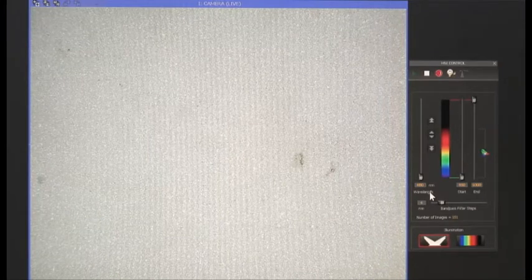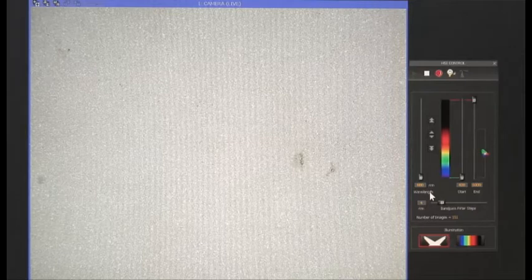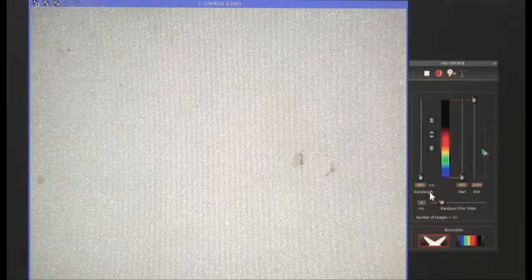Before the HSI can be used for the first time, it needs to be calibrated. This calibration will be automatically saved and doesn't normally need to be repeated unless the magnification is radically altered. The calibration is necessary to determine the camera exposure for each position of the bandpass filter.